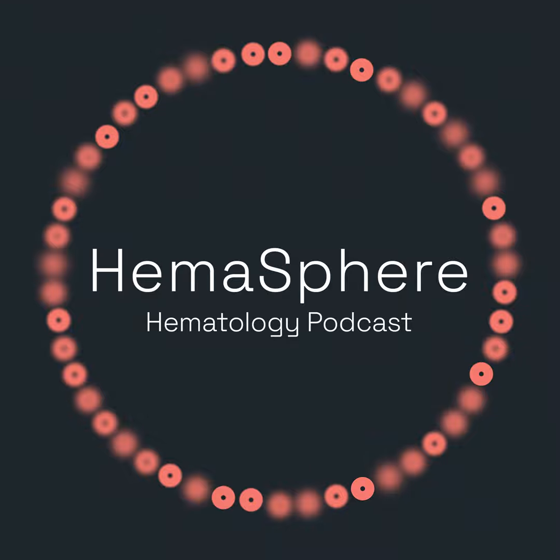I think the first step will be a hybrid situation. A lot of the reports that we looked at in our review are actually more of a computer-assisted methodology, where the computer highlights certain leukemic cells, and then you can go along with that, but you can also perform your own analysis on the side and then compare. I think that faces the least barriers.